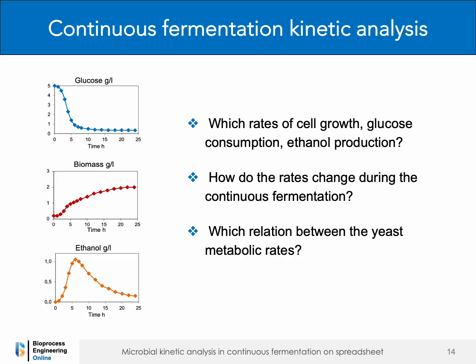The kinetic analysis of continuous fermentation aims to address the following key questions. Which specific rates should be determined? How do these rates change during continuous operation? What is the relationship between the rates of cellular growth and metabolic activity? By answering these questions, we can gain a deeper understanding of how microorganisms regulate their metabolism under steady-state conditions, and how growth and metabolite formation are interconnected.